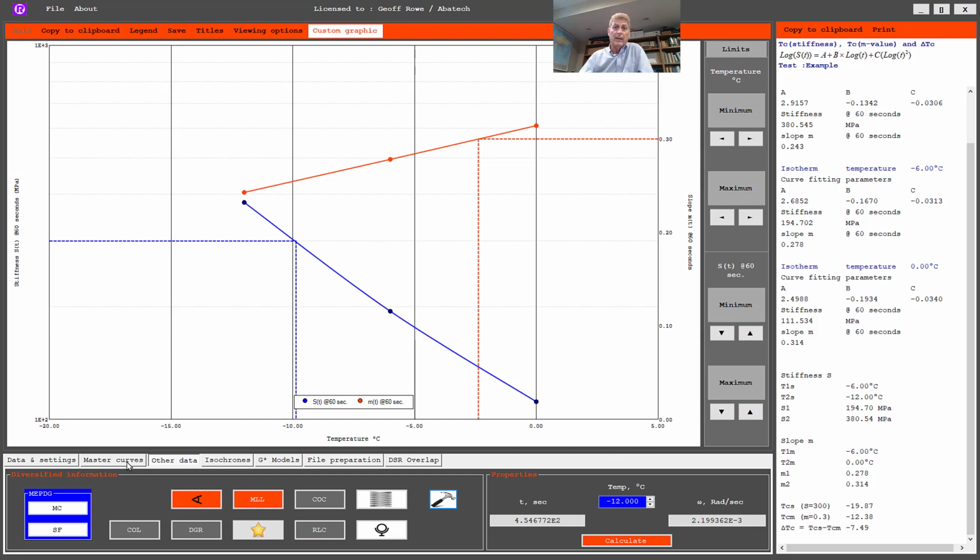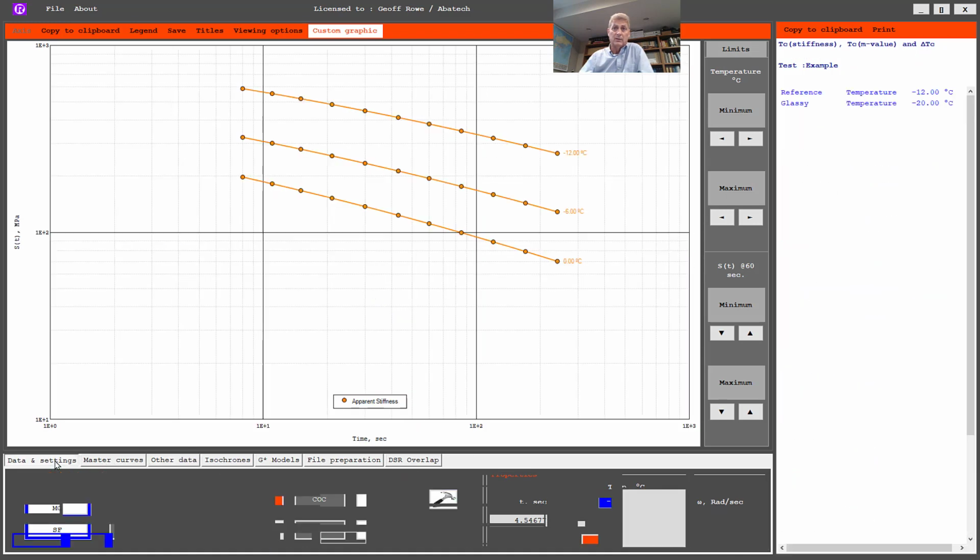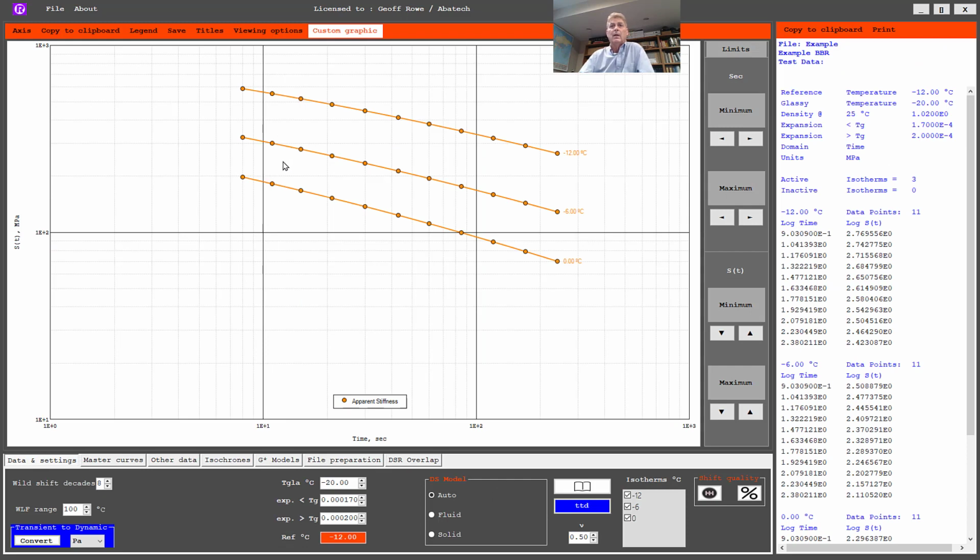One thing I should point out when we look at this, the data set and the data that's going into this analysis, is typically with a bending beam data set, we normally will see 6 data points being used. But because we're analyzing this data in an automatic way, we feel that it's more of a robust analysis if we obtain 11 data points.